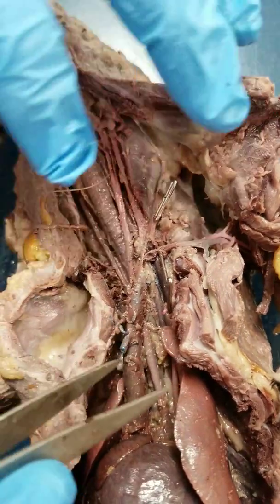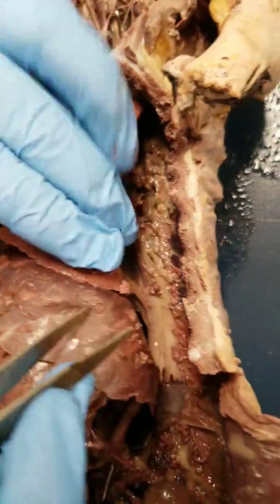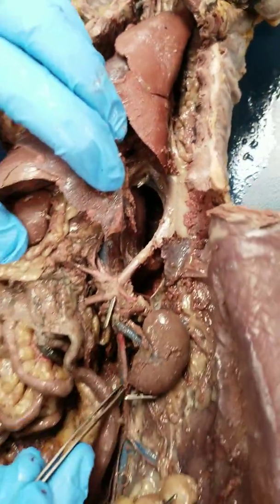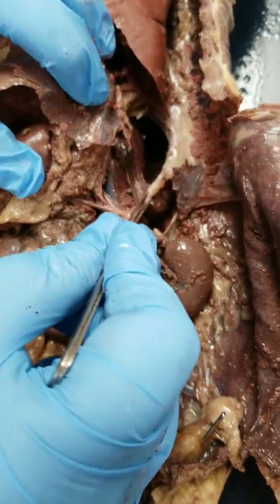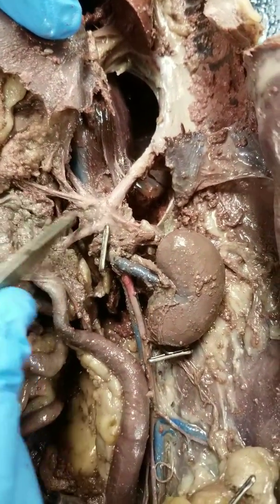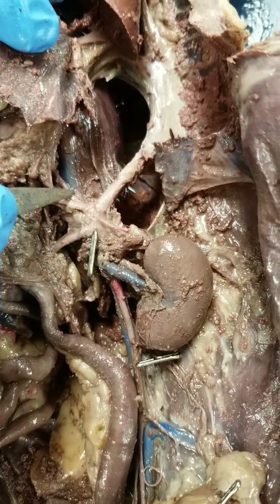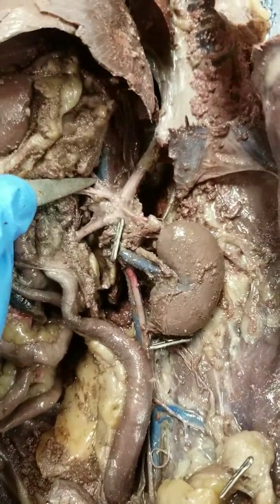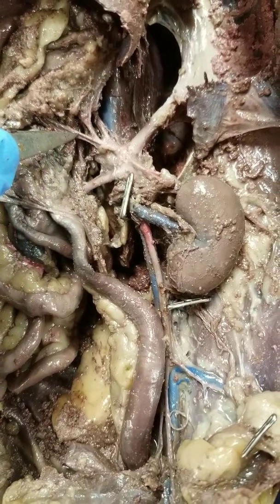Going back to the aortic arch, if we pull the lungs back, you'll see the thoracic aorta. Above the diaphragm it's the thoracic aorta; it travels down and becomes the abdominal aorta below the diaphragm. Removing the diaphragm from the thoracic cavity wall really helps to see this. This is the superior mesenteric artery that goes to the small intestine. This is the celiac trunk, which branches to supply the organs in the celiac area: you have the hepatic, the gastric, and the splenic — these are listed in the same order in your chart.